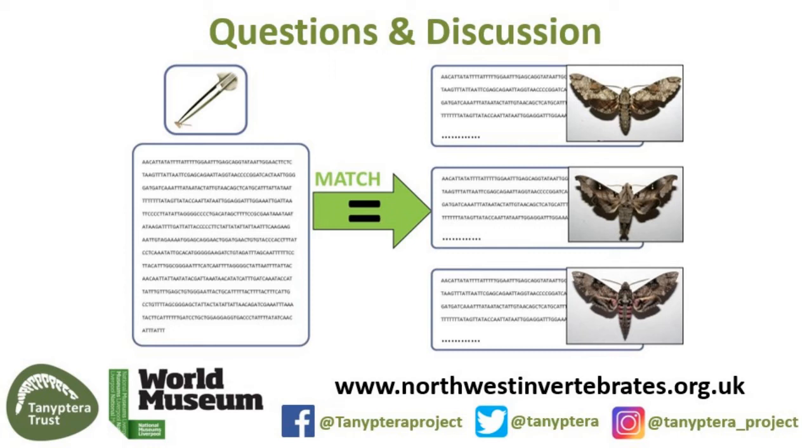Yeah, so for insects, it seems to be that dried specimens actually are the best source of DNA. For other types of animals that I've been working on, ethanol is better. At the museum, we have a lot of specimens stored in IMS, so denatured ethanol. It does seem to have negative effects in terms of the DNA quality. So maybe the DNA is degraded, not so easy to amplify with PCR.